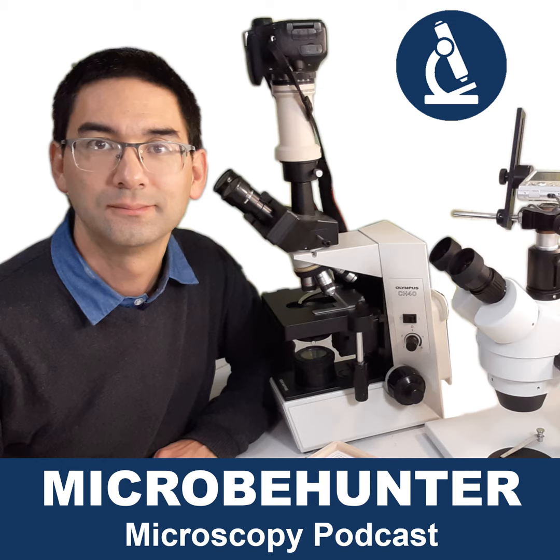So in my microscope, I bought myself a 20 times objective. It's not a very common one, but for water life, a 20 times objective with a 10 times eyepiece gives me a total magnification of 200 times, and that's really nice because most of the water life can be seen sufficiently large, but not too large, so I can easily follow them around.